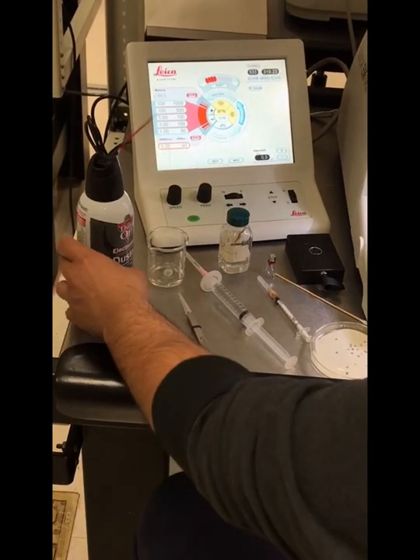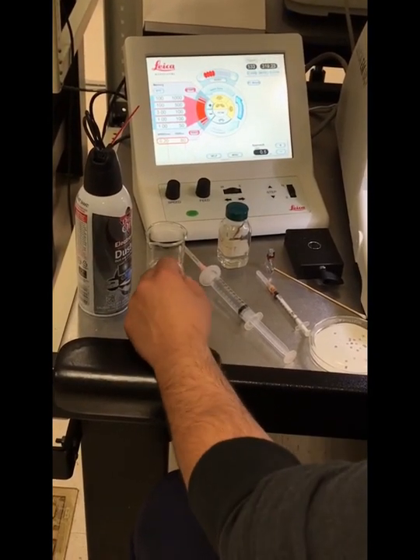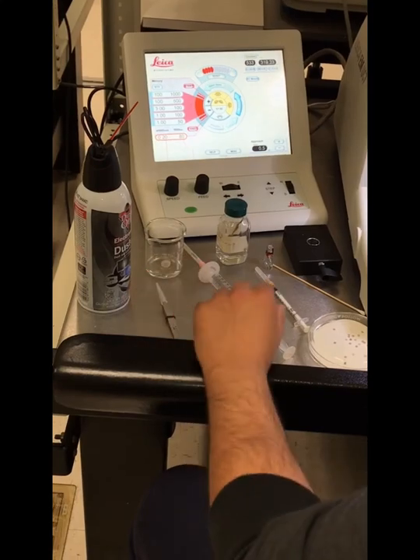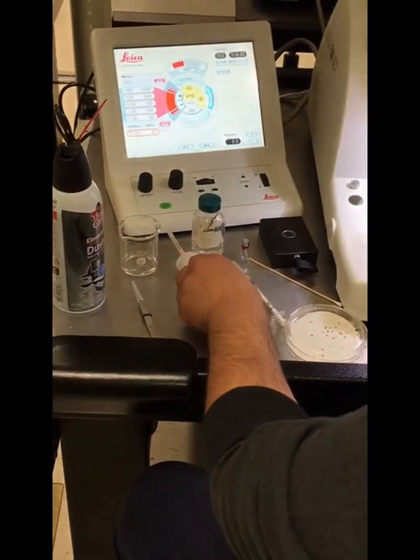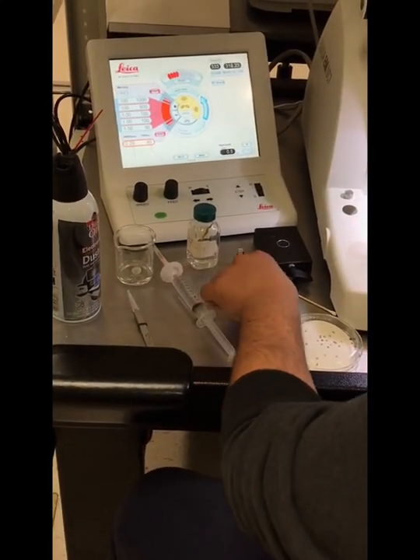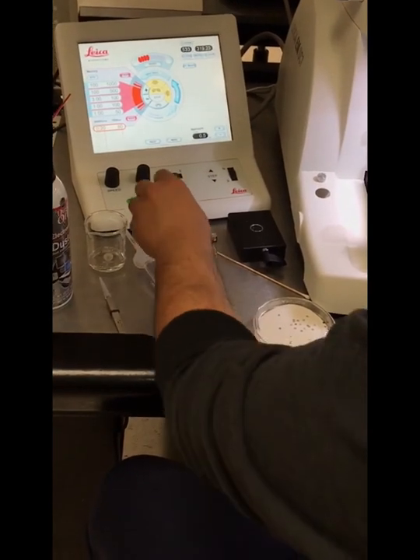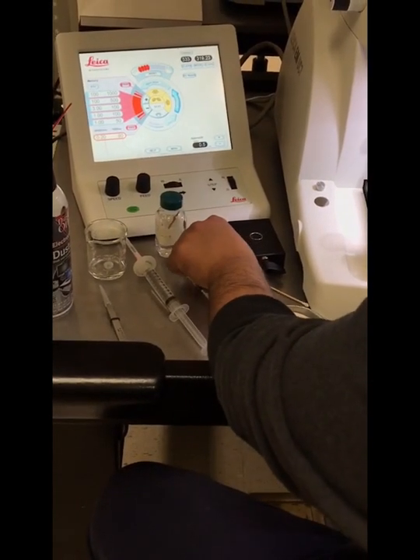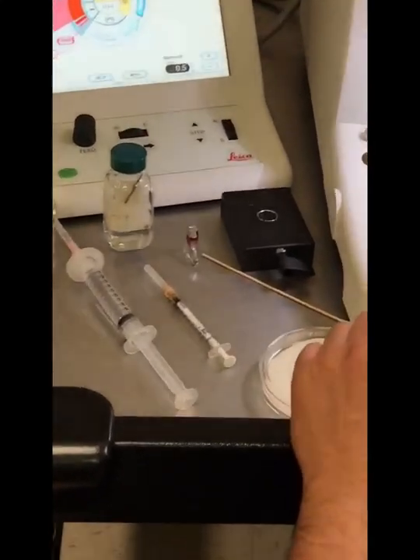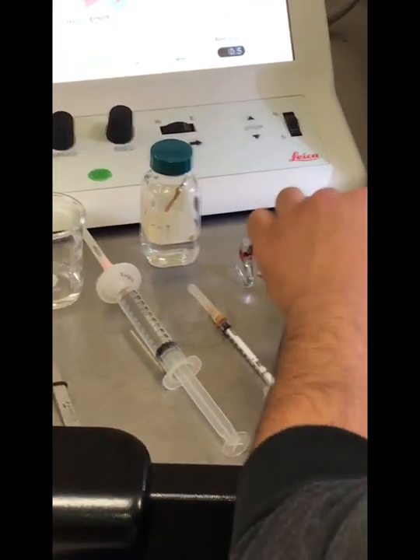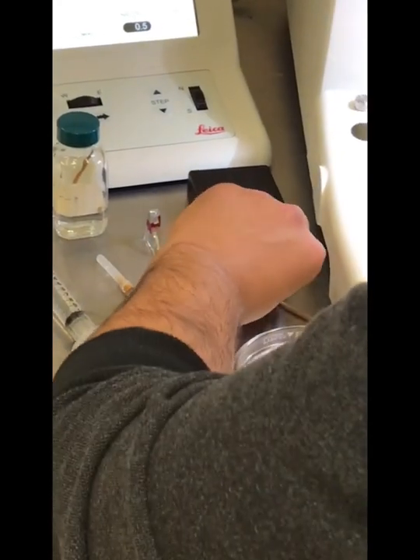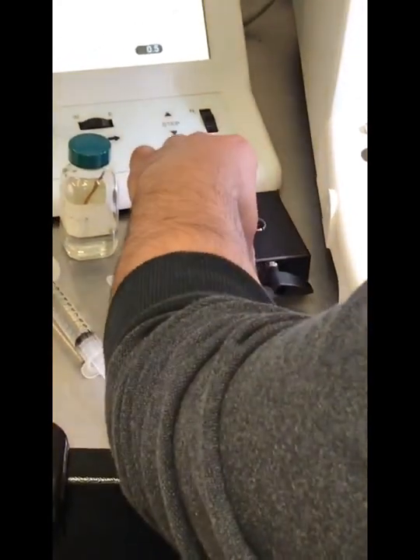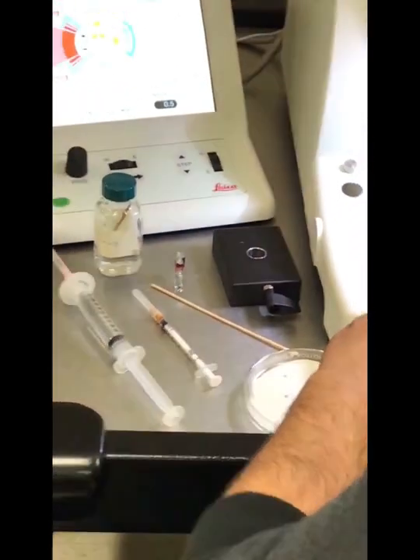We'll have some duster, a beaker, forceps, a syringe with a filter, another syringe, chloroform, diamond knife, and a glass knife with the boat. We'll have our grids and a perfect loop.